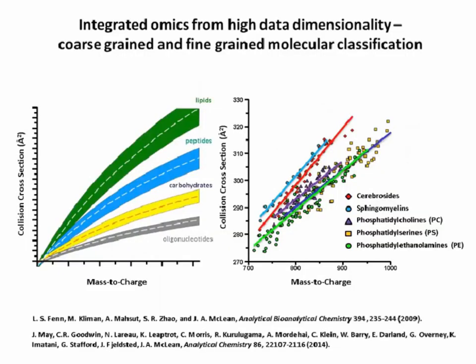Now, the second reason why we like the ion mobility approach is because early on we found that the different types of molecules, say lipids, peptides, carbohydrates, adopt structures or collision cross-sections which directly depend on the prevailing gas-phase folding propensity for those molecules. Restated a little more simply, the biological scaffold and the chemical scaffold that these classes of molecules use, they preferentially adopt very different structures.